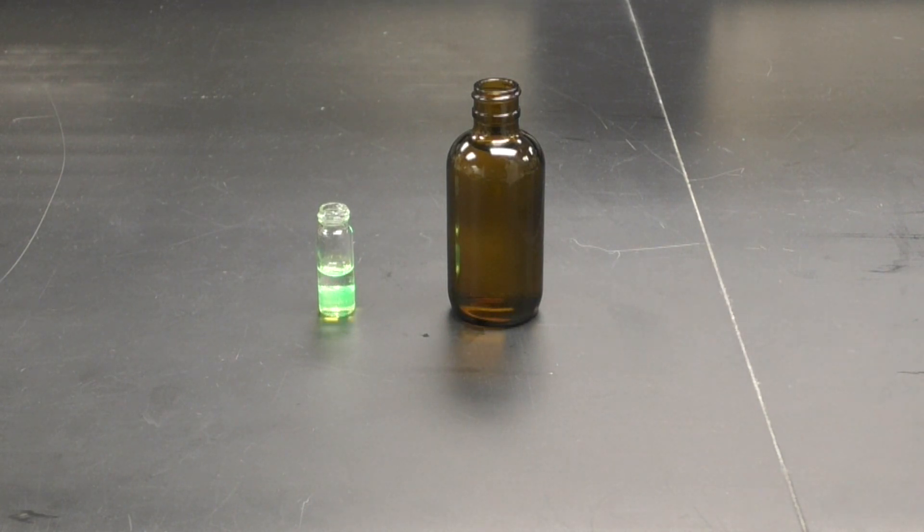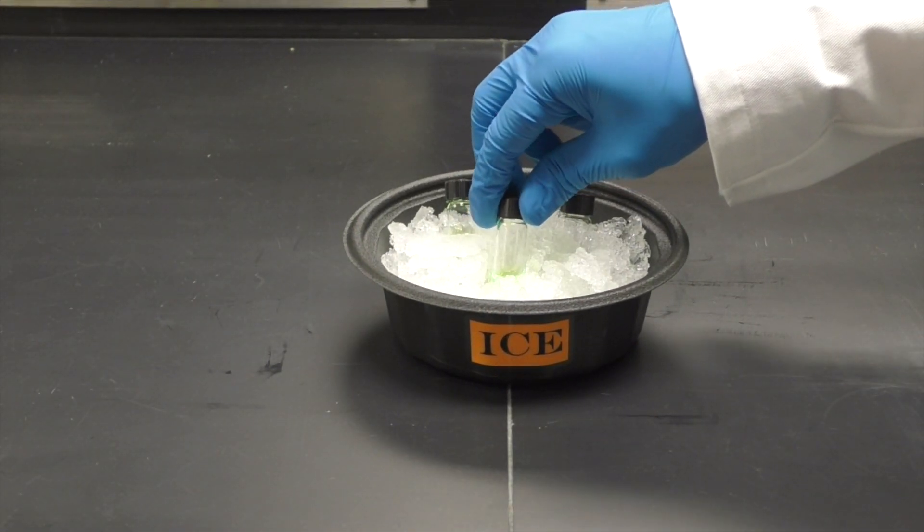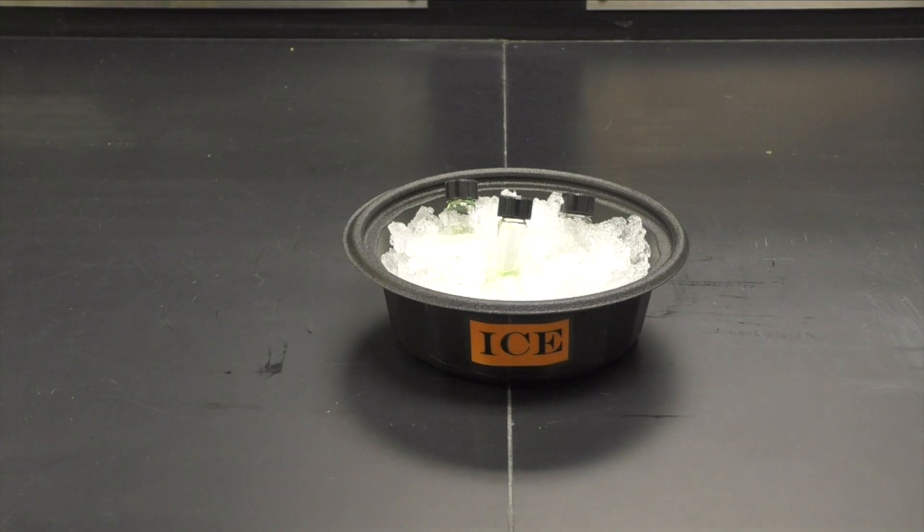If you plan to change the temperature of your glow stick solution, you will do so using an ice bath or a hot water bath. To cool your solution, place your capped 1 dram vials directly into a bowl of ice.